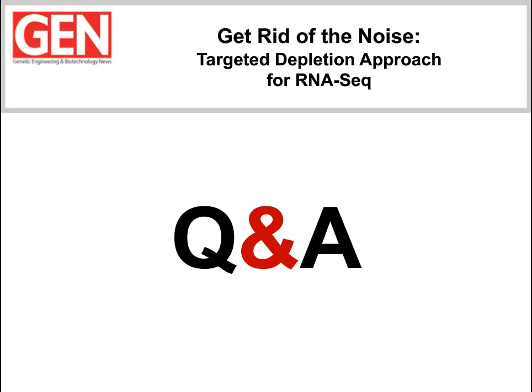All right, thank you, Ashesh. Maureen, the next question is for you. One of our audience members would like to know, are there any characteristic differences in final Solo libraries from high quality versus low quality RNA input?